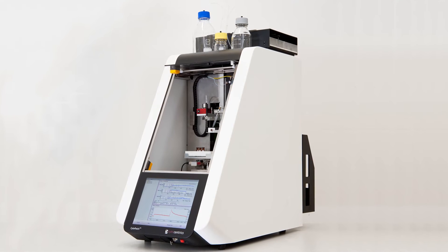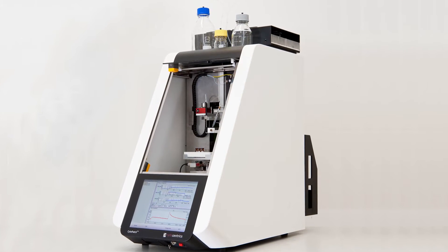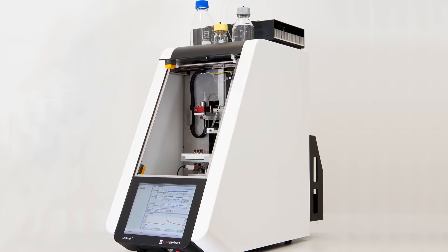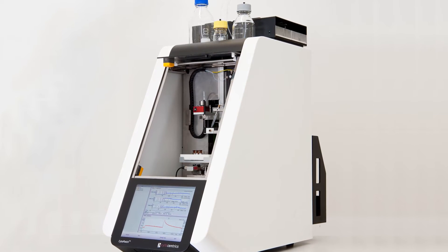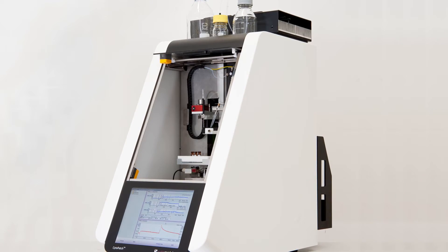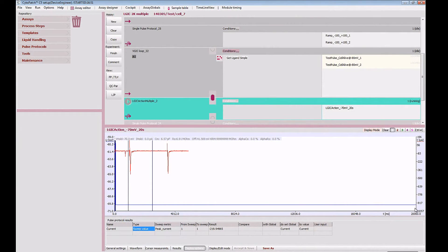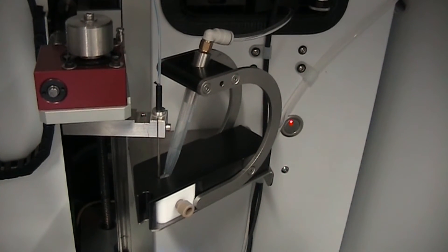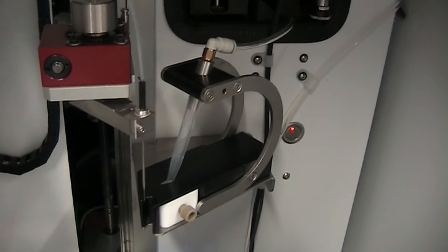The Cytopatch 2 is the new gold standard in patch clamping. Although it is a fully automated patch clamp platform and cutting-edge ion channel research tool, it creates real gigaseals and ensures the highest degree of data accuracy available. Offering software-driven assay flexibility, there is no need for patch clamp specialists or electrophysiologists to operate the machine. Once you start the assay, you may leave the rest up to the Cytopatch, including the application of compounds.